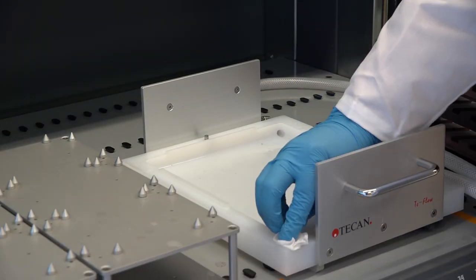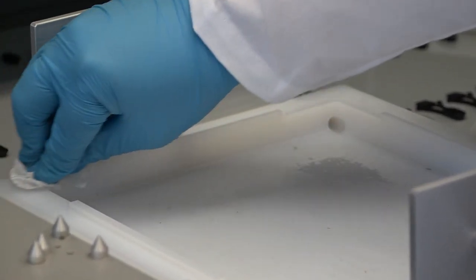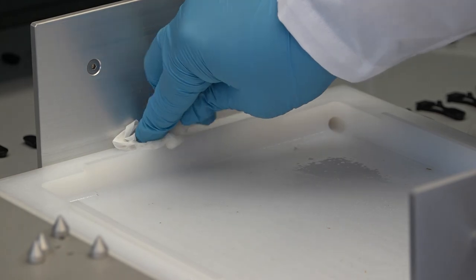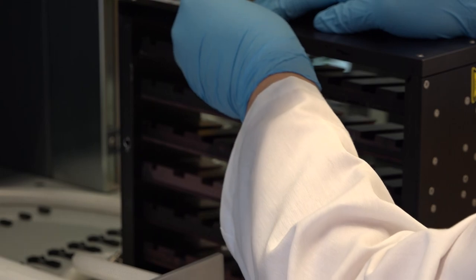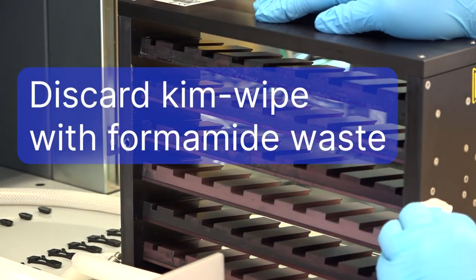Using KimWipes dampened with lab-grade water, clean all surfaces between the heat exchanger and the reagent pan to remove any reagent buildup. Discard KimWipes as formamide waste.